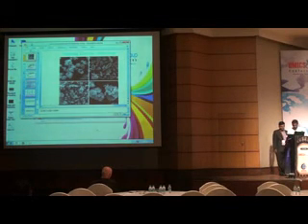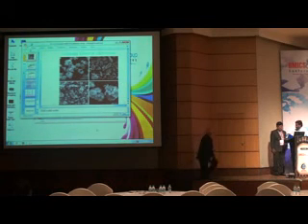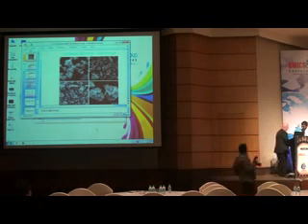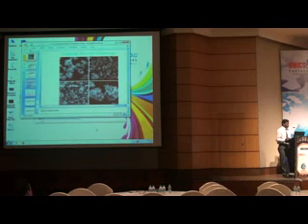No, sir. This is the only experiment we have done to understand the transformation of crystalline nature to amorphous form. With this, we have seen, and the SEM pictures also suggest that crystals of pure drug are not present in the solid dispersions. Do you also have access to Raman spectroscopy at your facility? No, sir. Okay, maybe you want to think of trying some of that also, because in a lot of cases whenever you do this, there is a small but finite possibility that morph transformation would also be taking place. And whenever you draw these conclusions, most people would ask you to rule out that possibility. Okay, thank you.